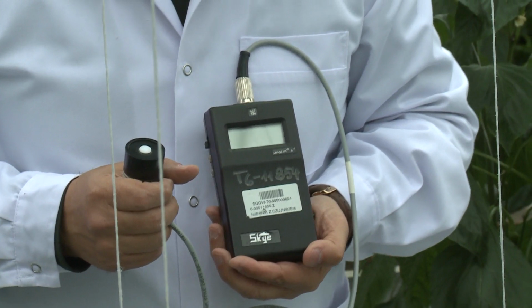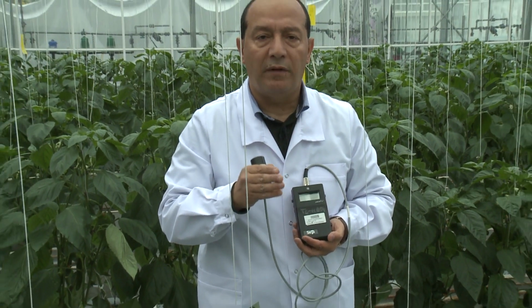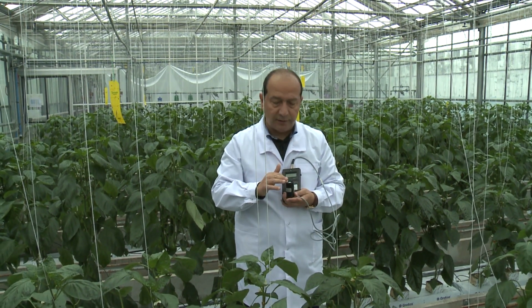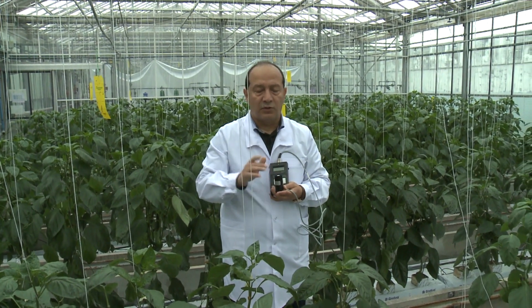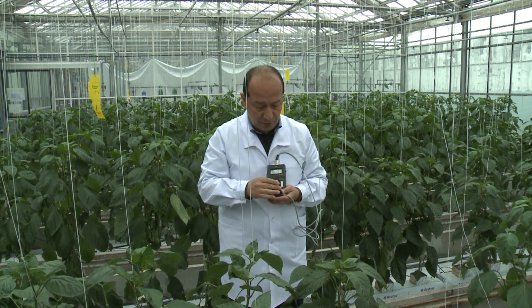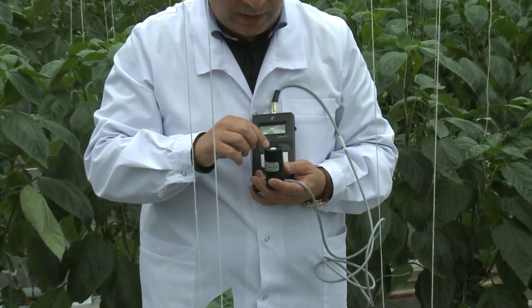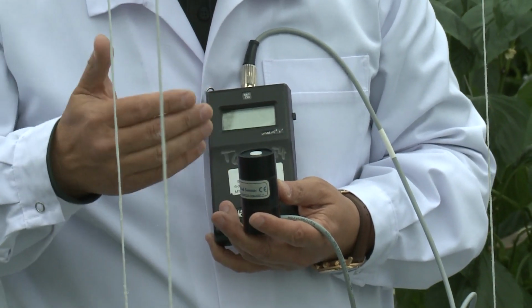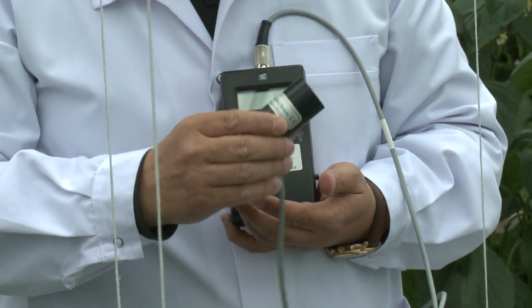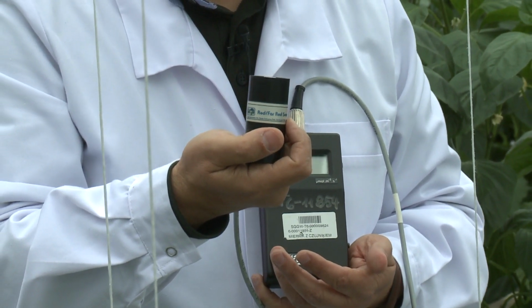So the next group of light sensors is designed to measure the light intensity at certain wavelengths. These types of light sensors, as we showed before, could be designed only to measure the photosynthetically active radiation, which is in the range of 400 and 700 nanometers. And that will be one photodiode built into this light sensor. But on the other side, we can have many photodiodes inside, then we can measure the light intensity in different ranges. So we can have it, for example, like in this sensor, in the red and the far red region, which is 660 and 730 nanometers.